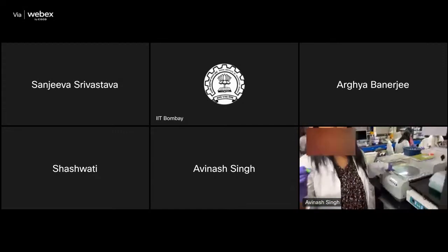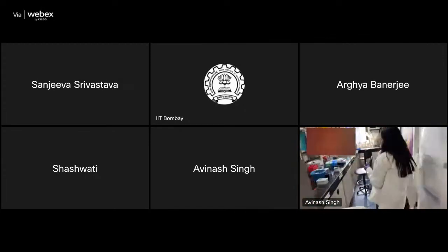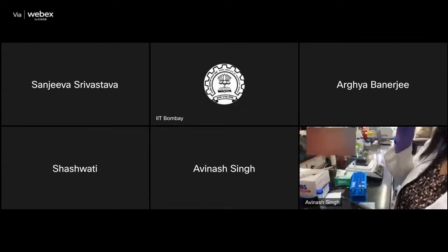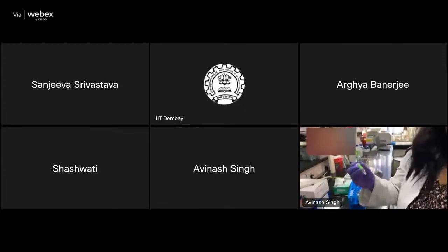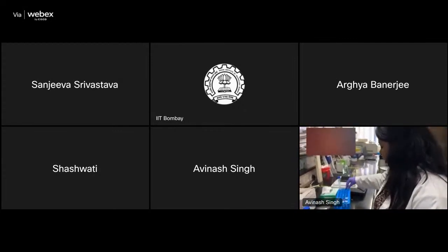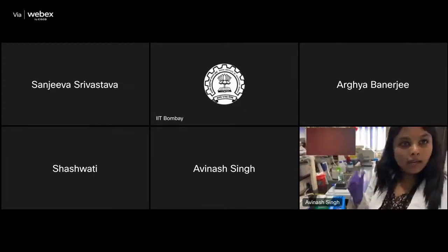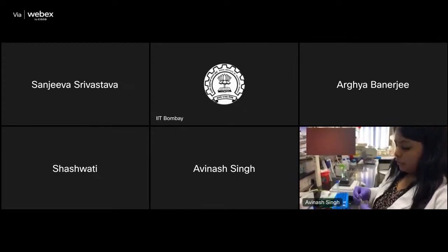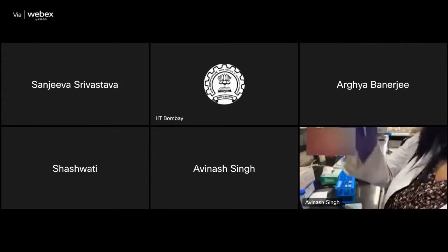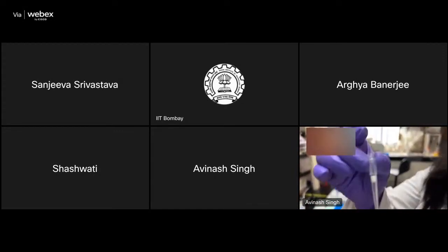the next step of sample submission would be, now, if you know that when we digest the peptides, we use a lot of buffer, and that has a lot of salts in it. So before submitting the sample, we need to purify these digested peptides. So we use this particular C18 column material. We pass the sample through this column material to purify the peptides.